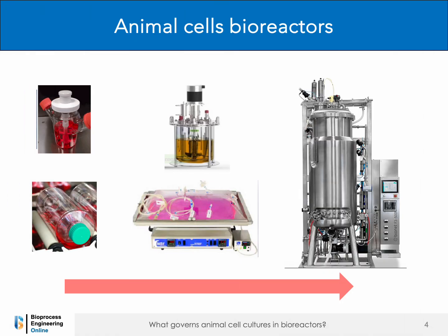For biopharmaceutical production, animal cells are cultivated in a diverse range of bioreactor systems, spanning small-scale formats, such as roller bottles and spinner flasks, to large-scale industrial stirred tank bioreactors.